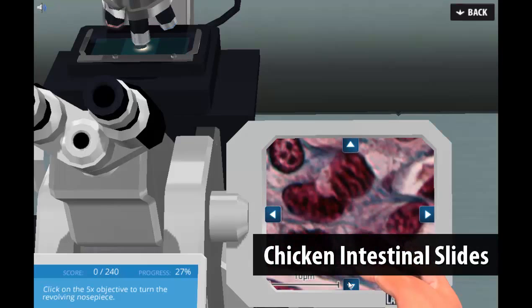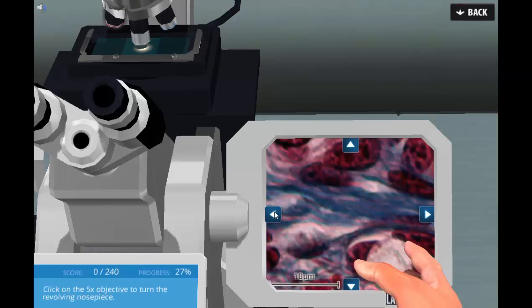They are presented with chicken intestinal slides that have been stained with aniline, orange G, and fuchsin.